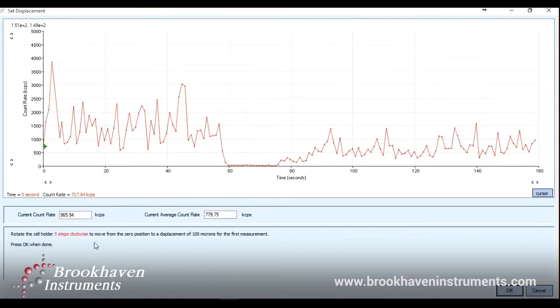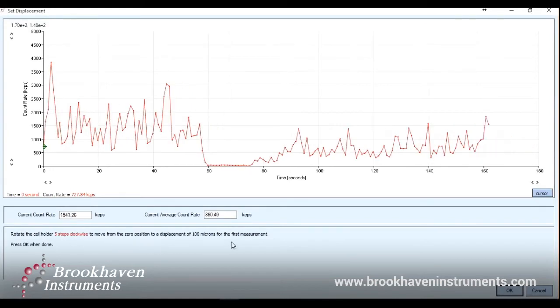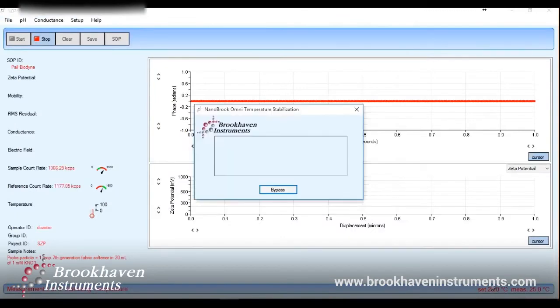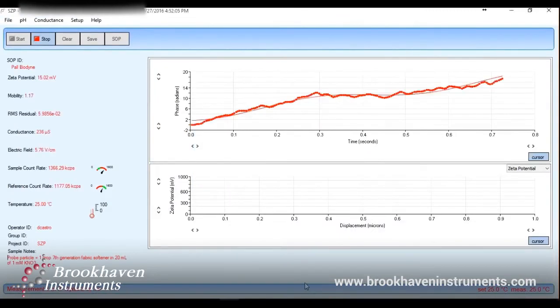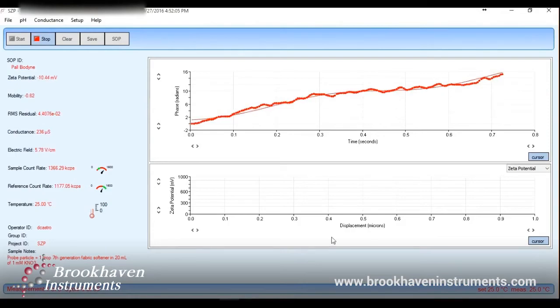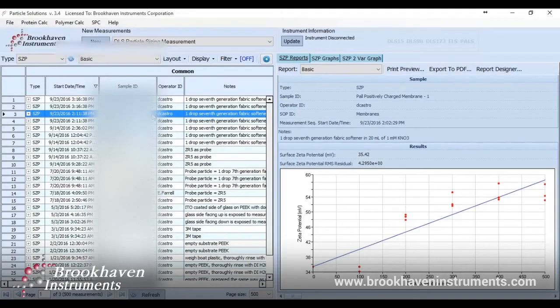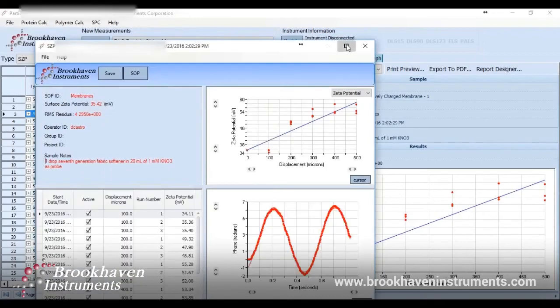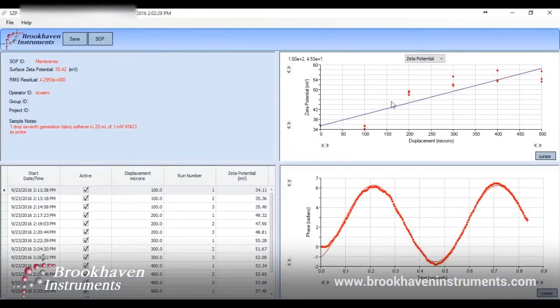We will move away from our zero point by 100 microns by turning the wheel five clicks and clicking OK. Zeta potential measurements at this displacement will begin automatically. Once the specified number of measurements at this displacement is completed, a window will appear for you to move to the next displacement, 200 microns, and so on. Once measurements at four displacements have been made, you have the option to keep measuring at further displacements of your choice in increments of 20 microns. Once the zeta potential begins to level off, that's a telltale sign that the measurement is complete. You would expect the zeta potential to begin to plateau at the value of the zeta potential of the probe particle solution you are using.